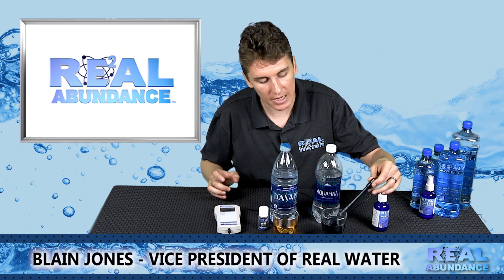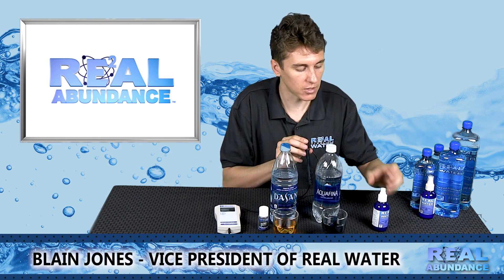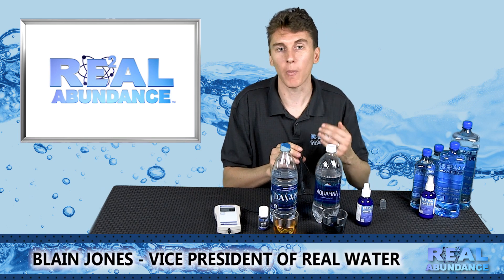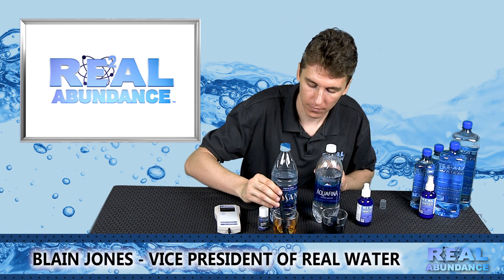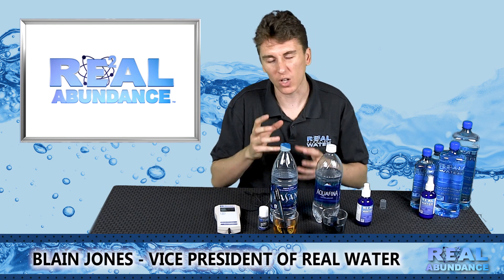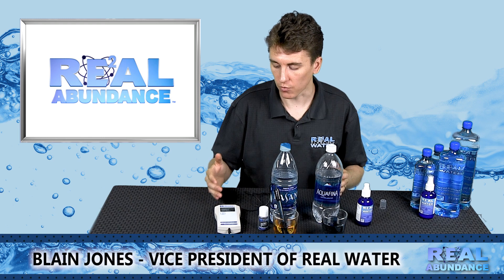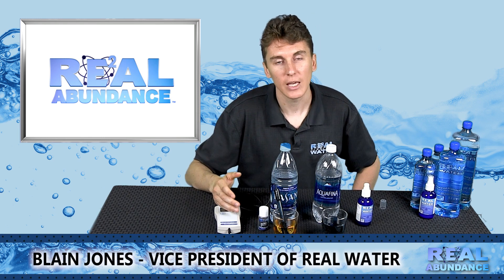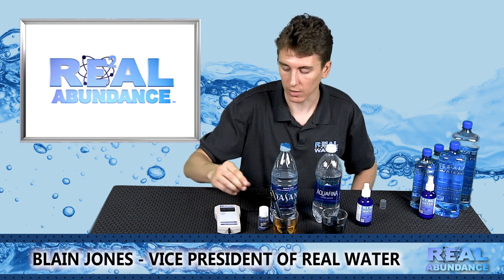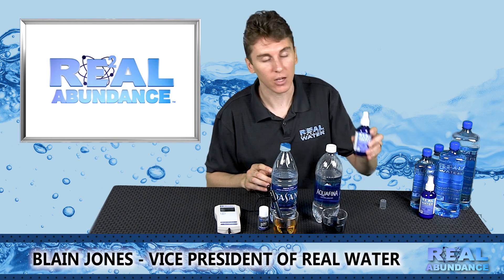When testing, you don't want to leave the probe in the negative solution for too long. Inside this probe there is gel that soaks up whatever solution you are testing, and because the Real Water E2 concentrate is so powerful with negative ionization, it will store in the probe for a long time and takes a while to go back to reading positive. Also, do not test sodas or juices with your probe — that will clog it or cause it to need more frequent calibration. If you want your probe to last, only test with bottled waters, keep it properly calibrated, and don't store it in a negative solution too long. It should last 9 to 12 months if you take care of it and it is a very good tool for demonstrating the Real Water concentrate.